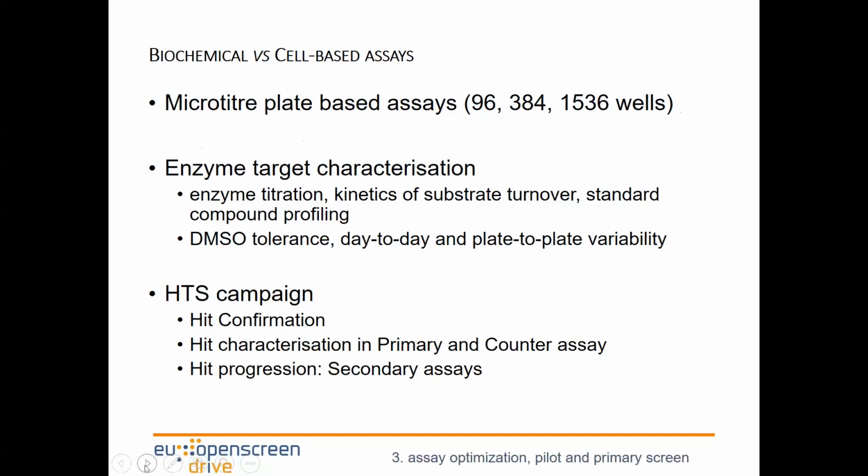With a cell-based assay, as we often do not know how much protein target has been expressed, there is a limited number of mechanistic studies that we can do. However, both are complementary. Often with a drug discovery project, you would probably want to have a biochemical and cell-based assay in parallel, and then you can confirm the activities of the hits in both assays and understand the mode of action of the compounds.